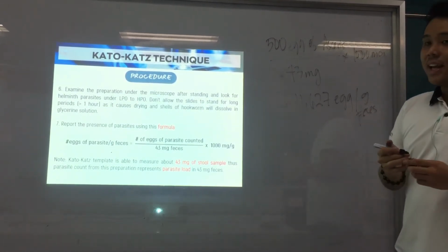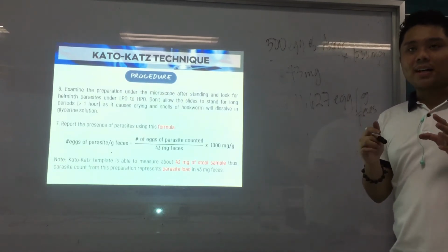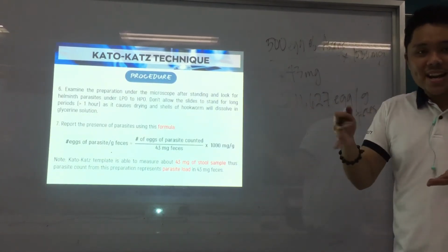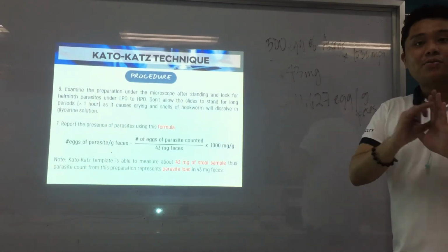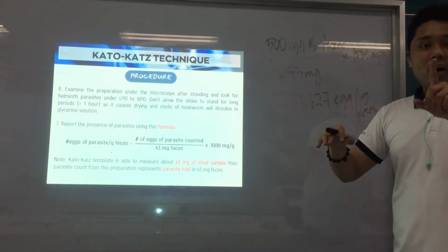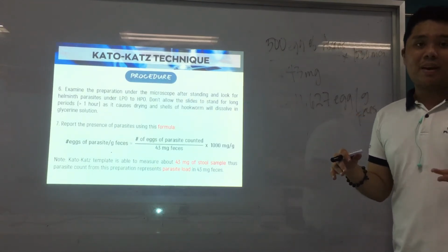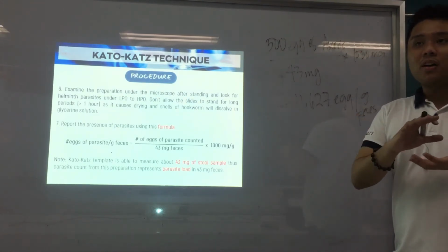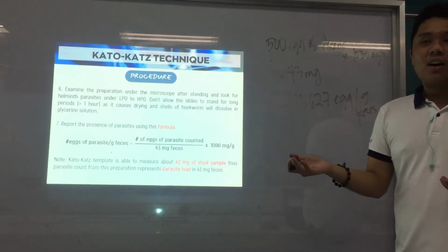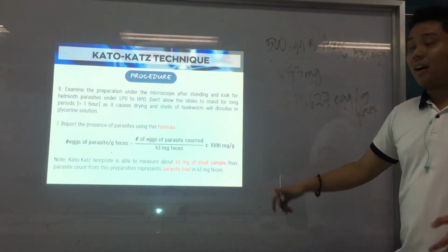So as you can see, it gives you already an overview, a glimpse as to how many eggs are found in the feces, in the stool sample or in the feces of your patient. So it is much more telling of the intensity of the infection of the patient with this particular parasite.